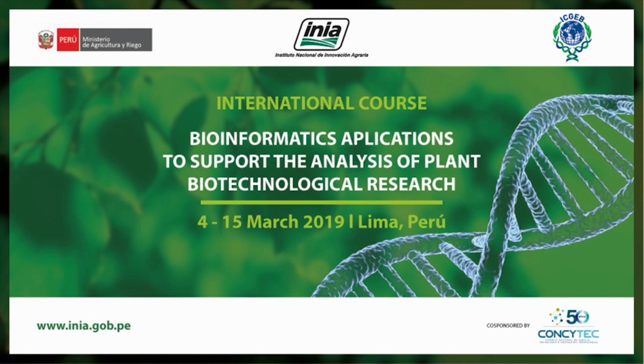Clustal. Yep. So if you could please open your BioLinux boxes, mount yesterday's MSA directory, where you had the multiple protein sequences. So are we all there? We'll start earlier than usual because we usually don't have enough time in a day to finish all the things we need to do.